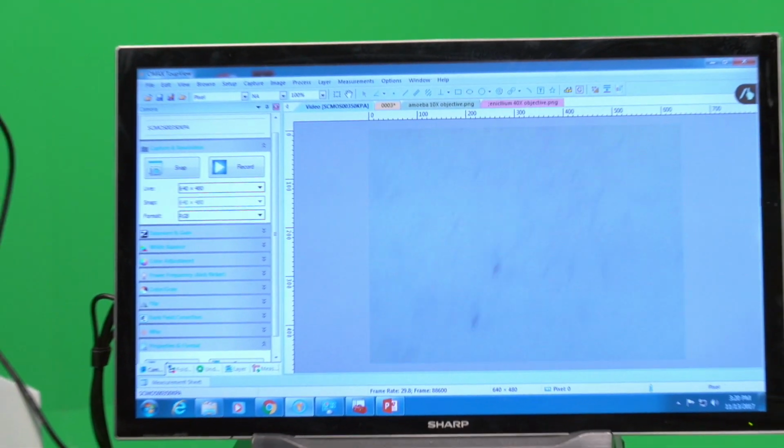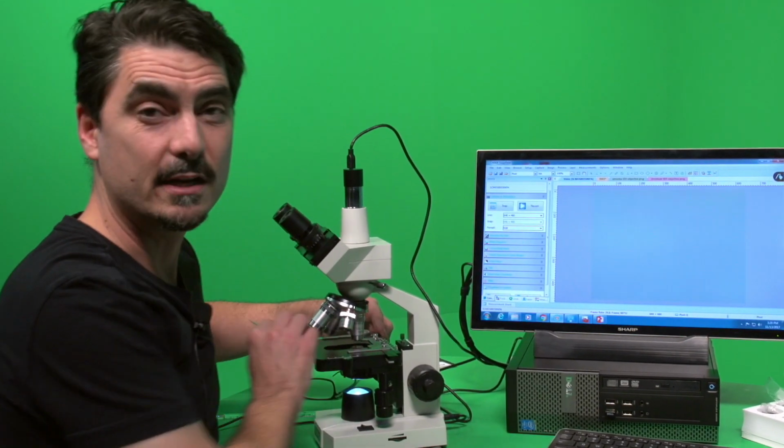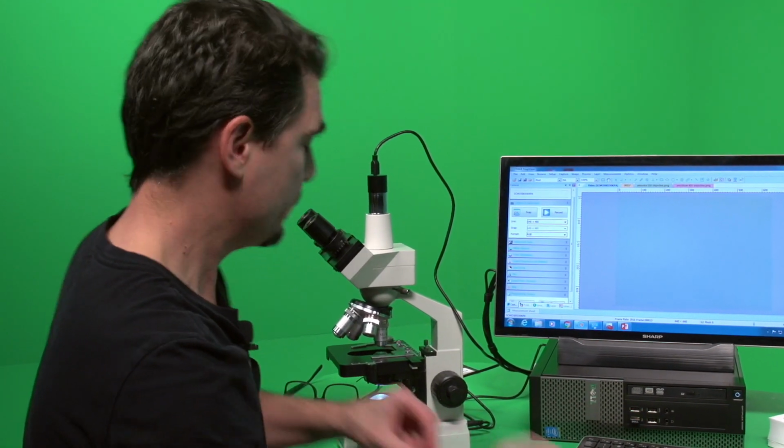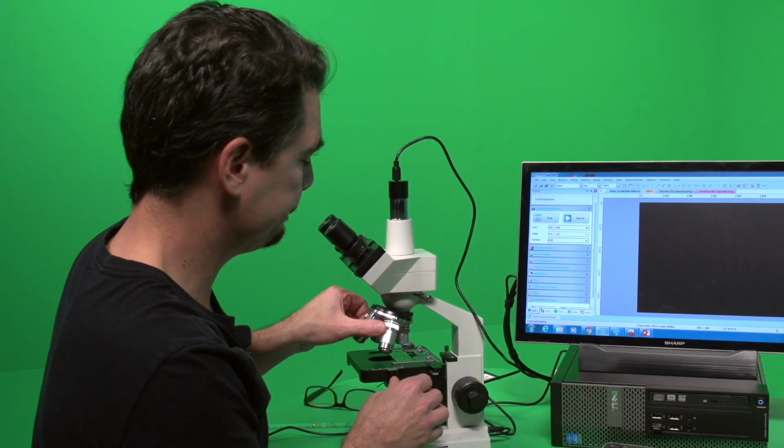So that's an example of direct microscopy on how to find your human cells and also not submitting garbage, right? Nobody wants to submit garbage.